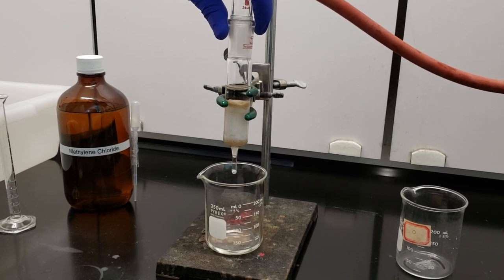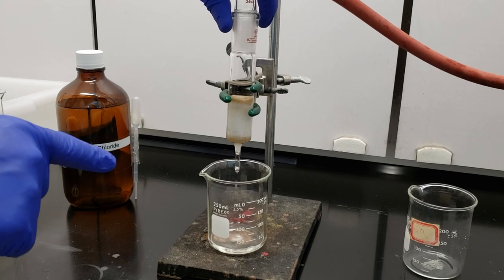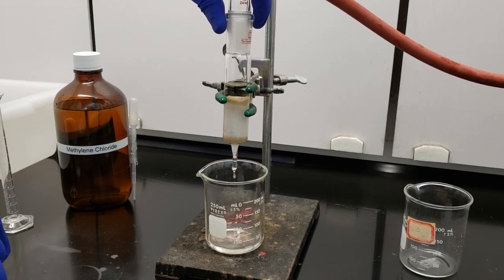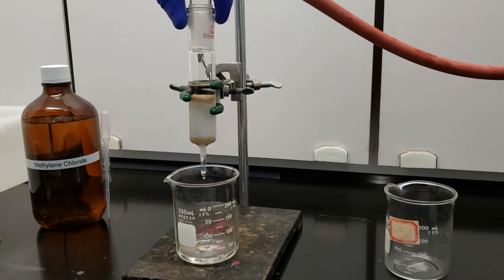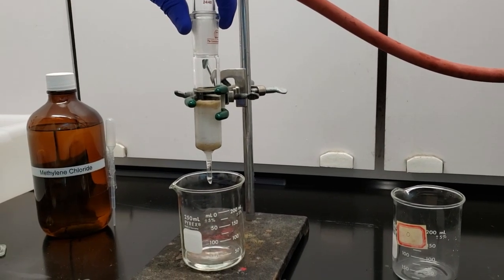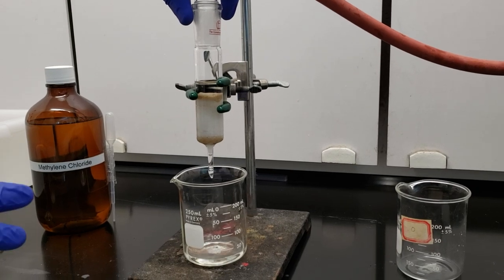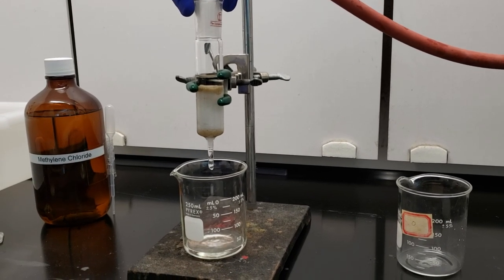Normally, column chromatography is done very slowly. We don't advance the rate the way that we're doing now, but this is an example of flash chromatography. We know that our product is the only compound that's going to make it through this column, so we can push it through at a higher rate and not have to worry about any contamination in our final beaker.